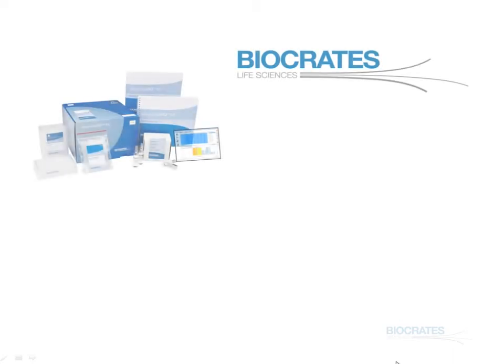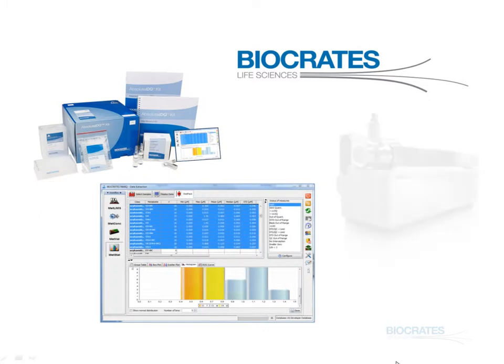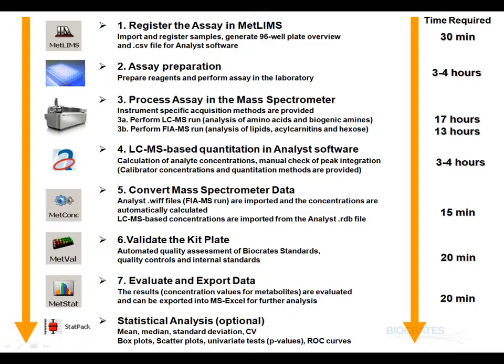MetIDQ is a suite of software application tools unique to Biocrates. MetIDQ has been designed for the AbsoluteIDQ kit to support the analytical laboratory workflow, followed by mass spectrometer analysis and the measurements of metabolite concentrations. The complete workflow from sample registration to the final biostatistical analysis and interpretation can be performed by MetIDQ.